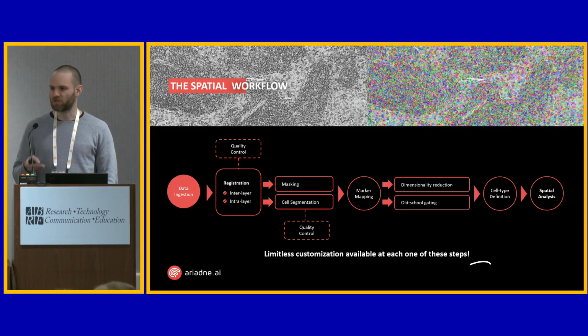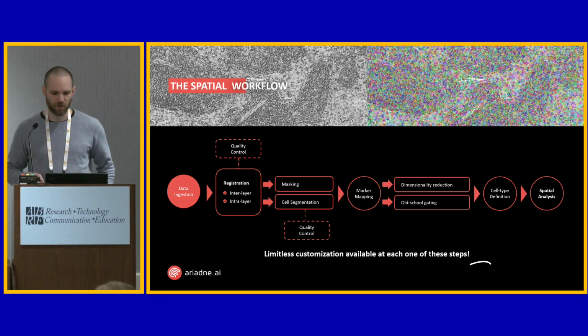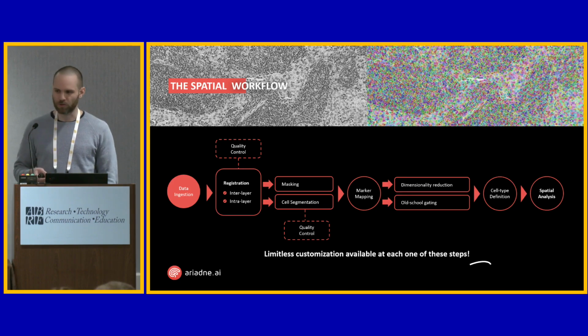Then you can perform registration either within layer or between layers to correct any complex stretching or shrinkage that you may have due to whatever protocol you applied. That is optional, but it's often helpful even for data that's nominally well registered.